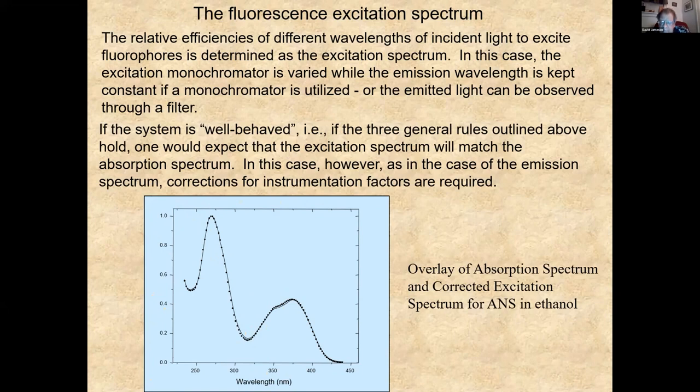Note I say corrected because actually there's a lot of corrections to correct the excitation spectrum for different outputs of the light source with wavelength, et cetera, et cetera. But we're not going into those details in this course.